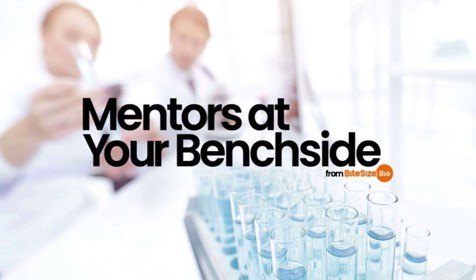Regarding point A, it's important to remember that cryo-EM structures comprise data collected from at least tens of thousands of individual yet identical particles. And regarding point B, it's important to remember that sample molecules scatter incident electrons, which are refocused by a series of lenses to produce an electron micrograph. Electrons scattered by the vitrified water encode no beneficial information about the sample.